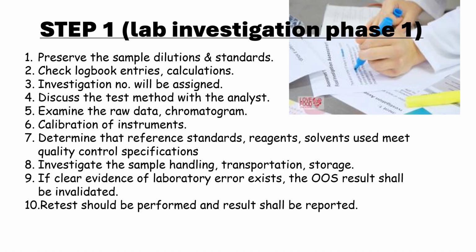The next thing, the analyst and the HOD, the head of the department, whoever assigns the task and checks if the analyst is performing the sample analysis correctly, should check the logbook for the entries of the sample, like whatever instruments were used. If the vortex machine, centrifugation machine, or evaporator were used, the HOD should check that the sample entries are there.